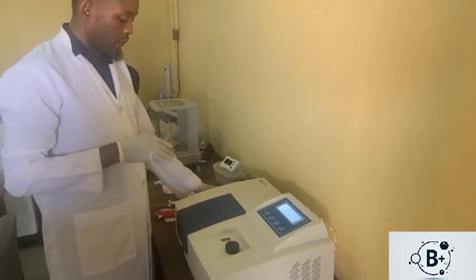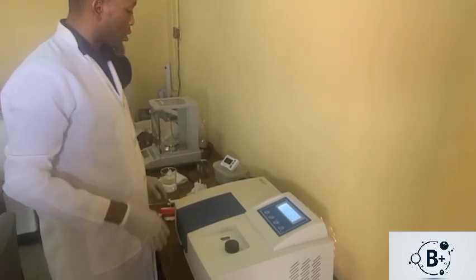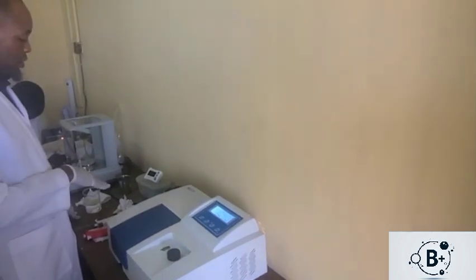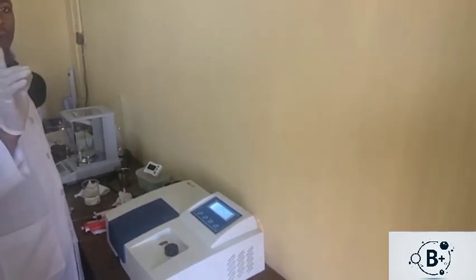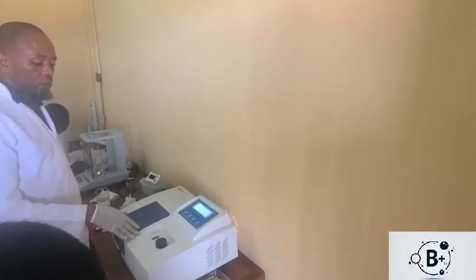Then, if that is also fixed, we can look at the other one, which is the CDNB, 1-chloro-2,4-dinitrobenzene. So we look at the dinitrobenzene to know if it's actually the cause. 1044. Then we can retry it again.